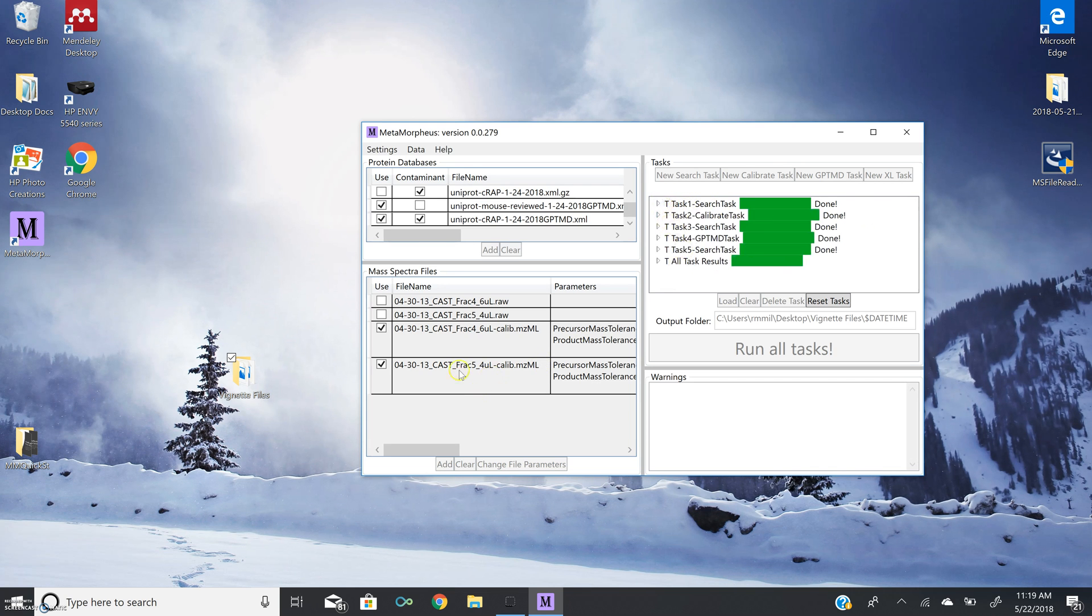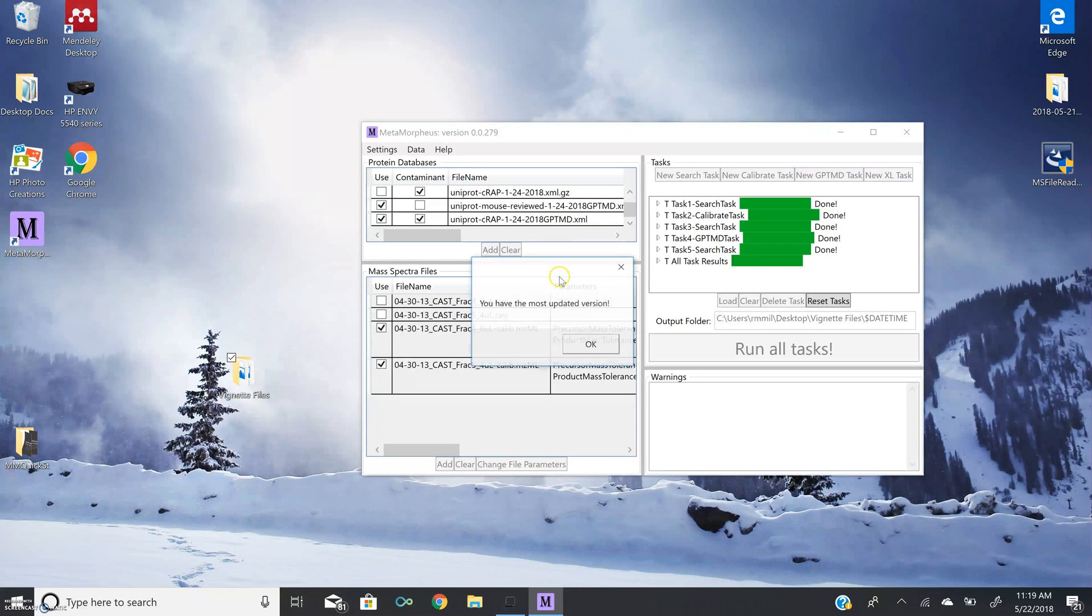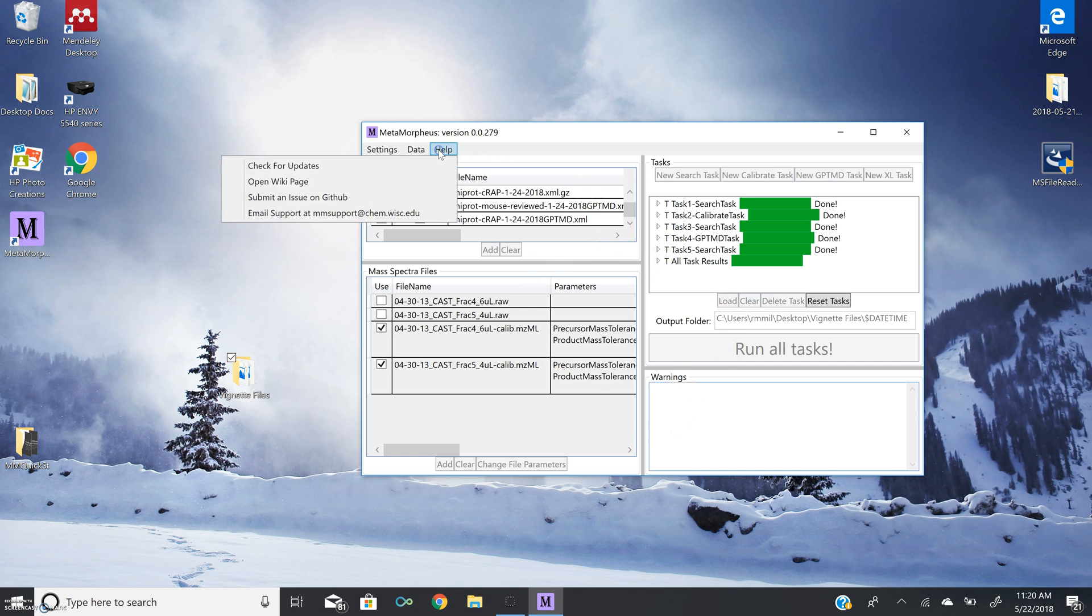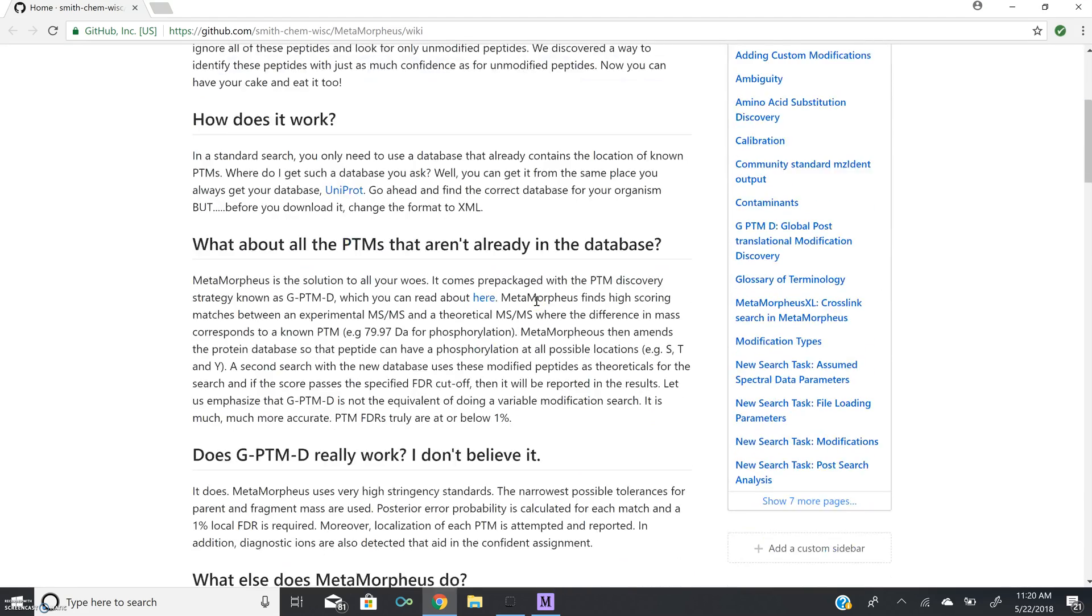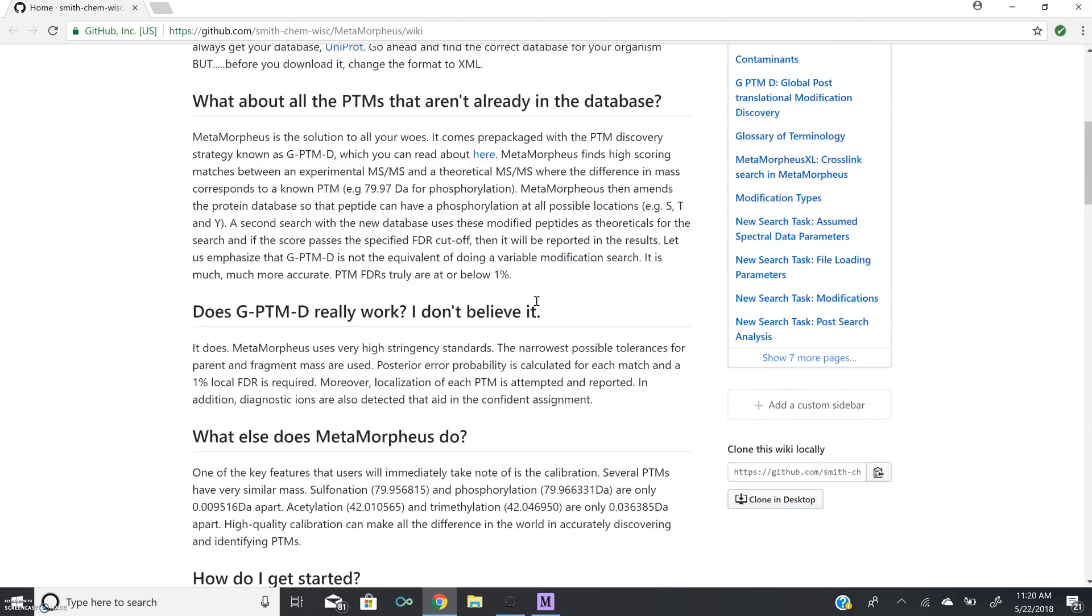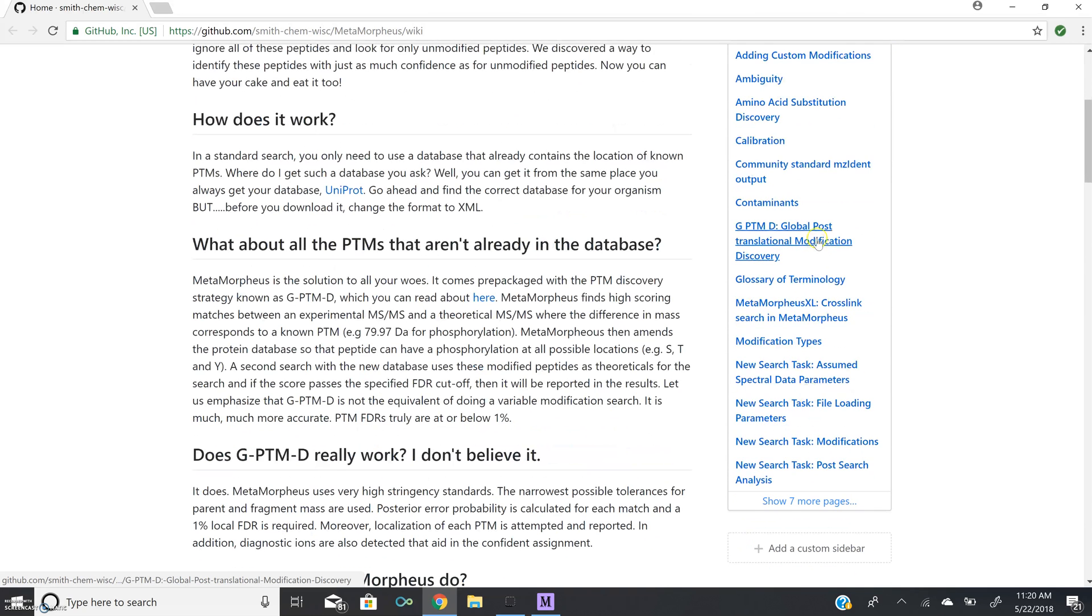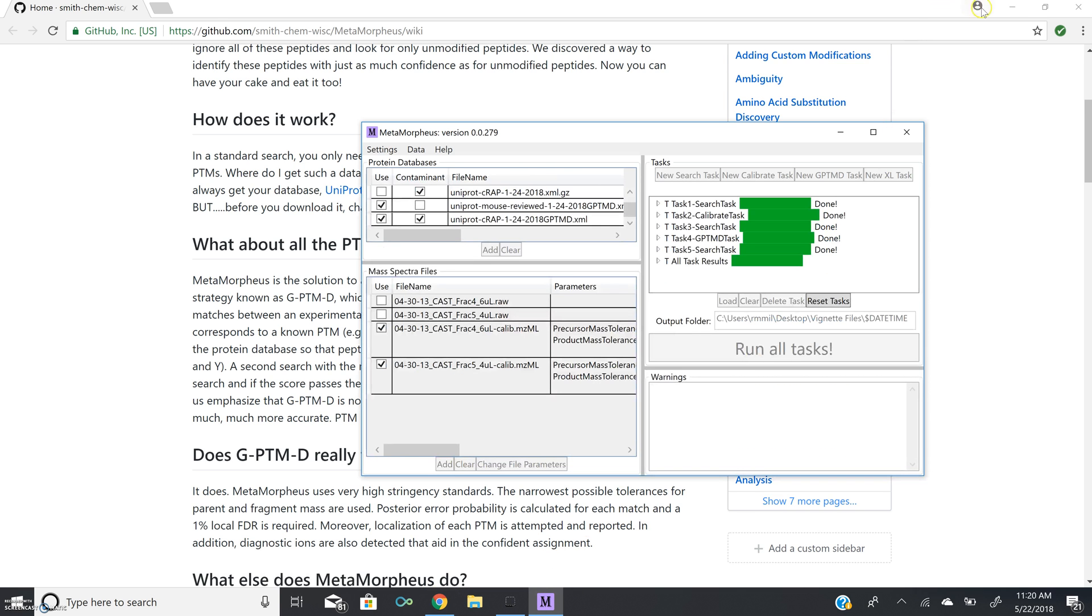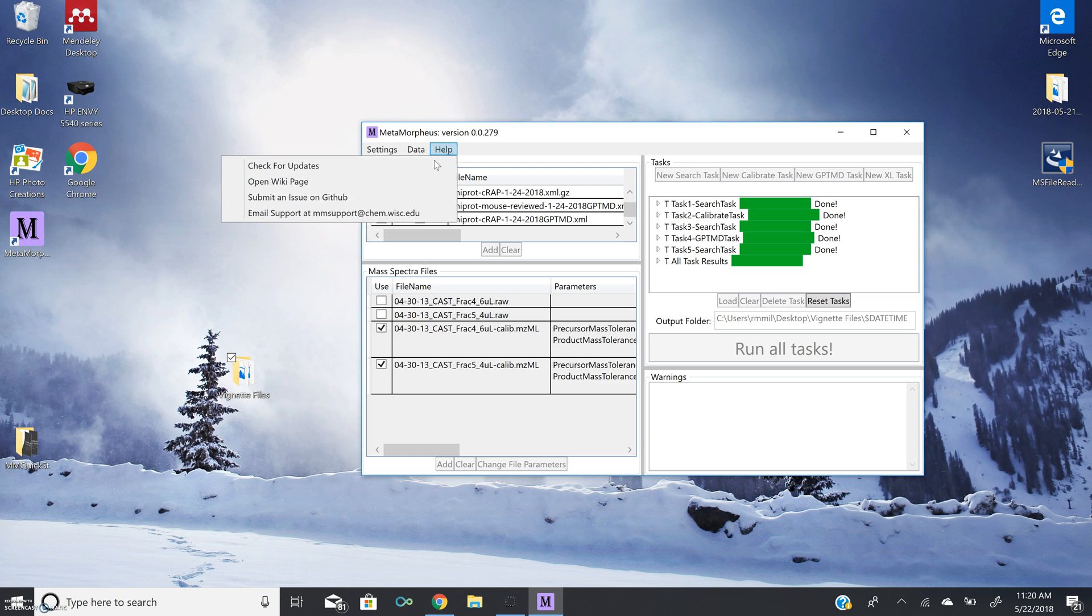The final thing I want to show you with our GUI is this help tab. Here, you can check for updates. And since we just installed this today, we already have the most updated version. Updates are also checked for when you open the GUI and it will let you know if there's a more updated version that you can install. You can open the wiki page, which is on our GitHub. And this acts as essentially a user's manual for Metamorpheus. If you want to learn more about GPTMD, our search tasks, et cetera.